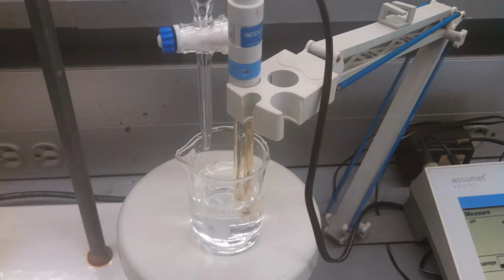For your standardization, you're going to do the titration the same way you did in experiment 3 in a 250 milliliter Erlenmeyer flask. For the unknown determinations, though, you're going to need to set it up so that you can have a pH electrode in the solution and dispense titrant with your burette at the same time. So this is the way to do that.